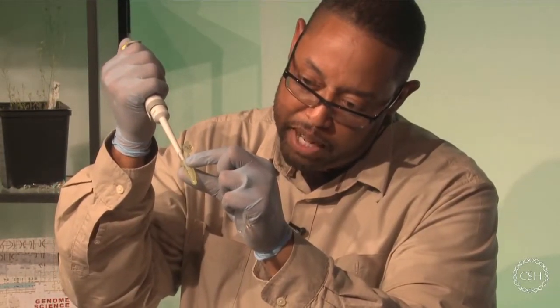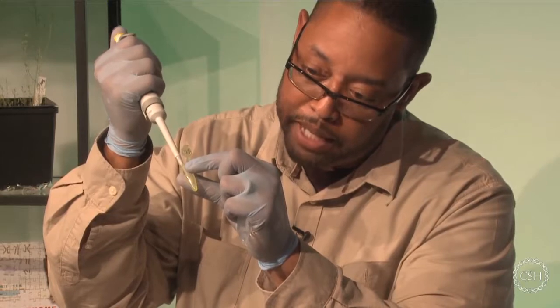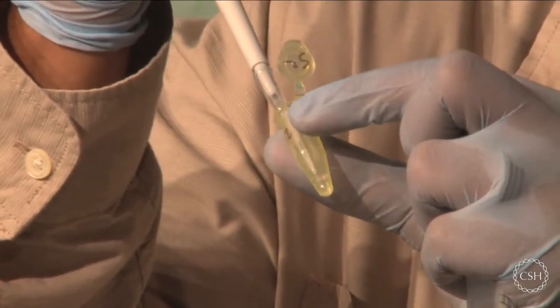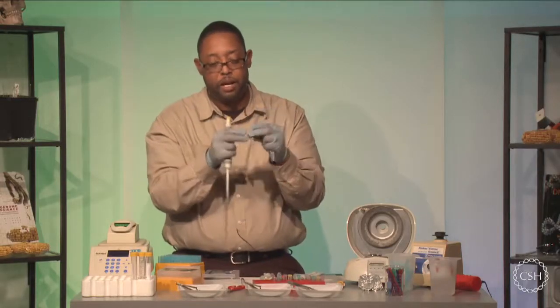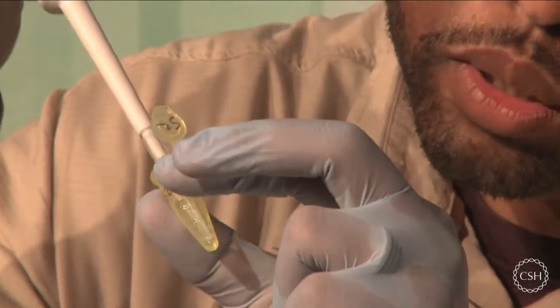And then I'm going to pipette up and down while I'm in there, disrupting my silica resin pellet. You can see that I'm pipetting up and down, and I'm basically trying to get my pellet to go back into solution. If it's giving you a little bit of trouble, you can finger vortex, but what I like to do is, with my tip, get down in there and try to crush this pellet back into solution.